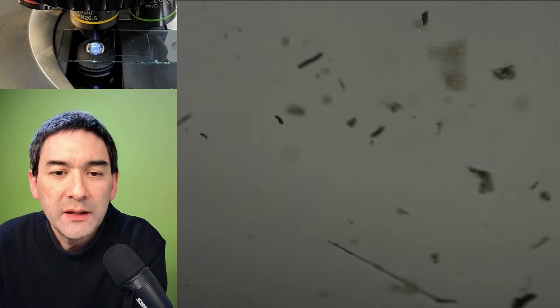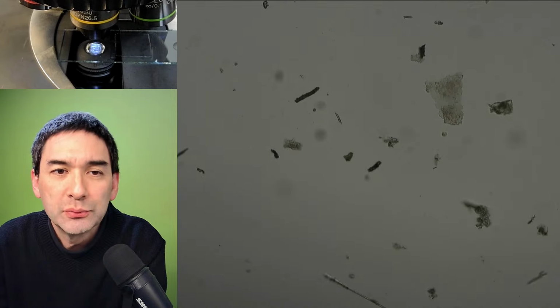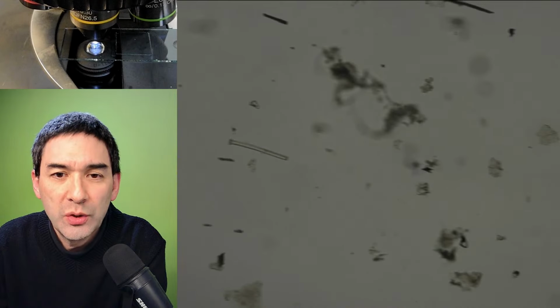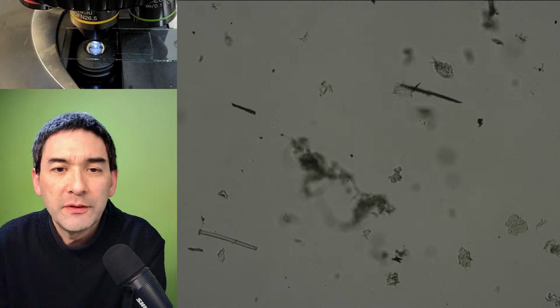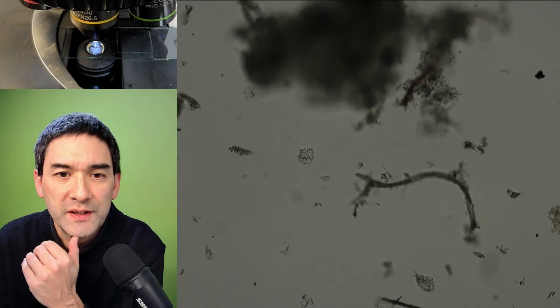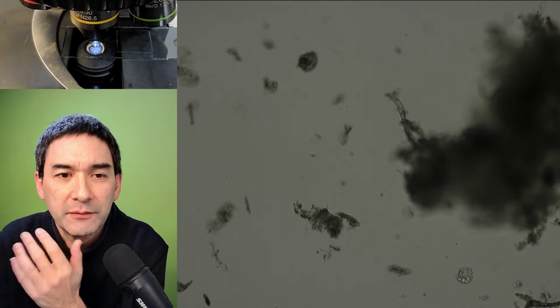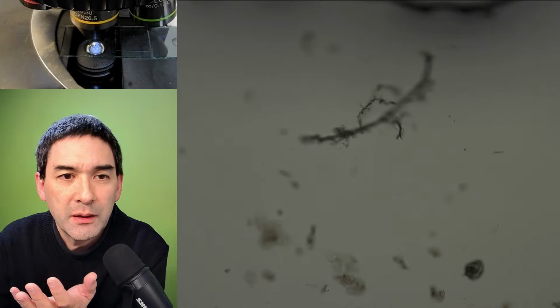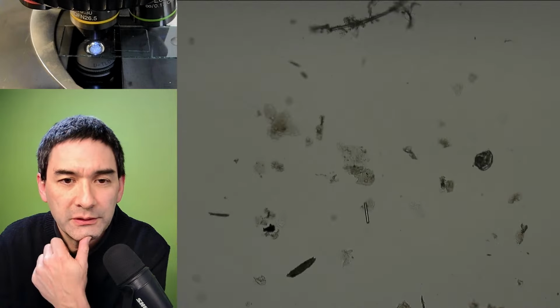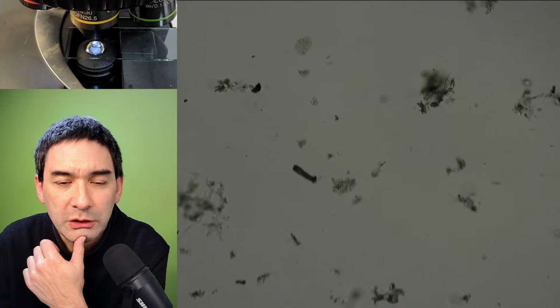And what you normally can do is the following. You can try to separate them by doing a so-called flotation. You add salt to the water, and then many of the fibers are less dense, and they will actually go up and float on the surface. So you see essentially all of this stuff that was not only dirt, but of course also from the clothing, things that have rubbed off, and started to then accumulate.